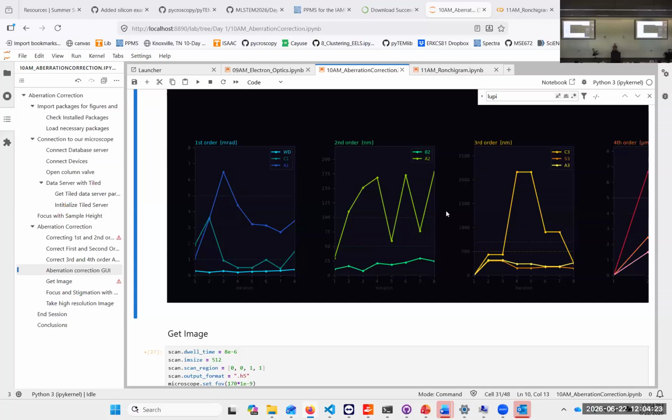It should slowly go sideways, but it shouldn't go in and out or anything else. So you can actually check the status and the quality of the stability of the microscope. The key thing is using the Ronchigram itself to monitor the health of your system.